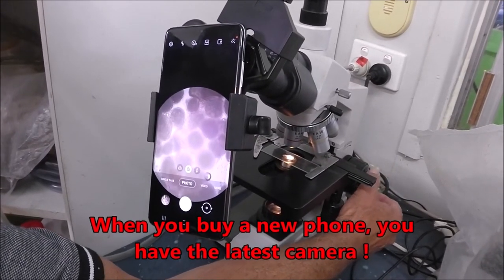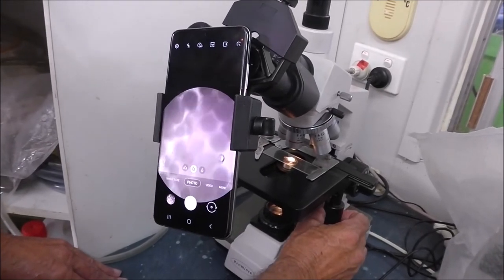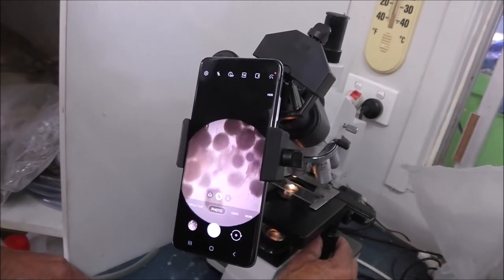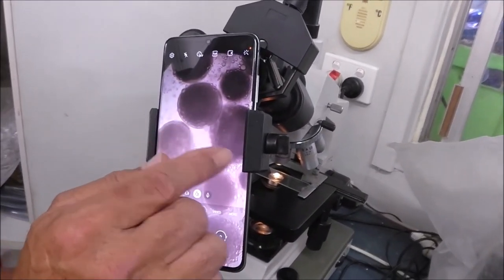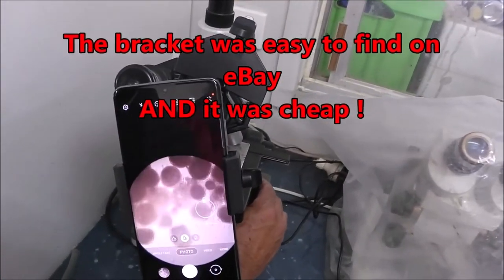Zoom through the egg. And I'm just going to position it a little bit better so we can see those individual eggs. Now what you might notice here is, I can zoom in into the centre of the field.